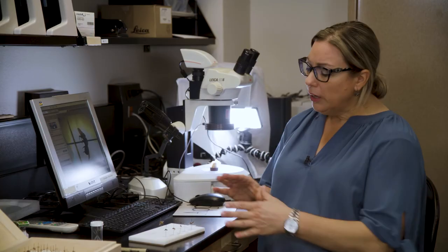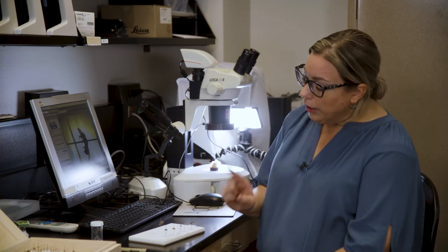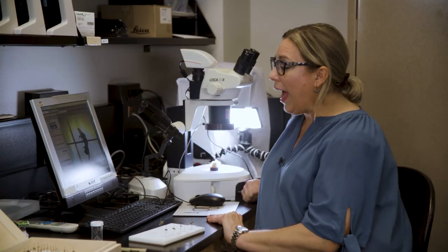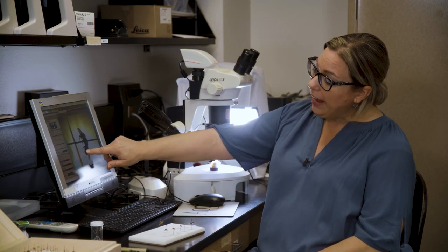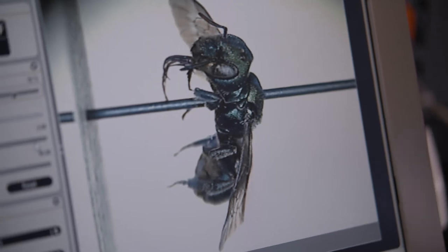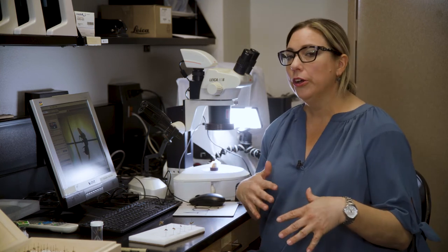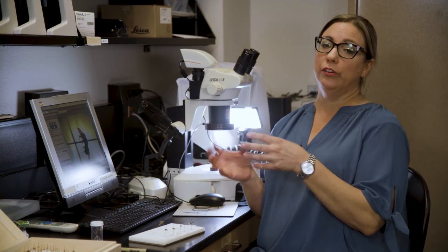Here is what we call our leaf cutter bee. The leaf cutter bee, the blue bee on the end, and the one I have in the microscope all have scopae — pollen-collecting hairs under their abdomen. That is a very key characteristic for this group, which is called Megachylidae — I just call them megachylids. You can actually make that one of the groups that students sort bees into.